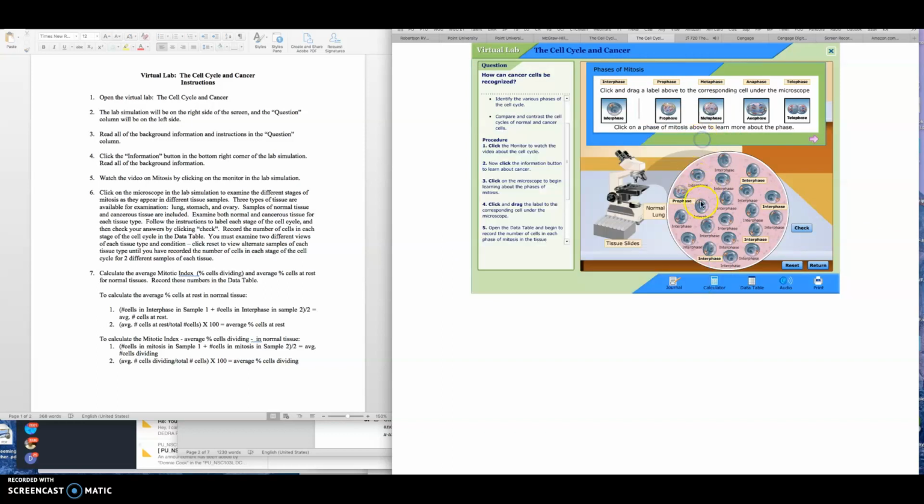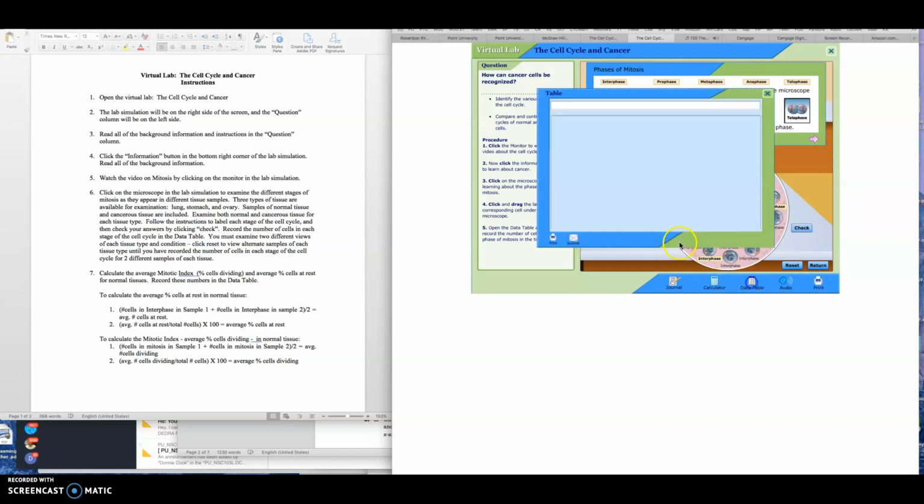Alright, so we had one prophase, and then 1, 2, 3, 4, 5, 6, 7, 8, 9, 10, 11, 12, 13, 14, 15, 16, 17, 18, or 19 in interphase. So let's say 19 and 1. And we didn't have any of the others. Okay.